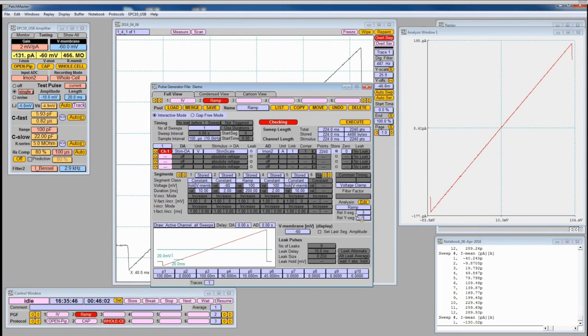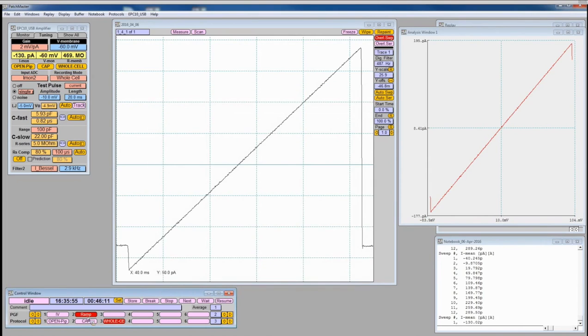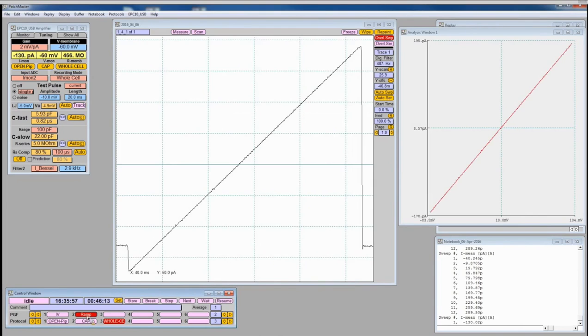It's still segment number 3 that is being analyzed. Okay, so, and this we close. And if we now run the ramp again, it looks much nicer. Okay, so here it is. The ramp has now very nice definitions at the beginning and end. Now these are little things, not really that super important, but it should give you an idea already of how complex the program can be and how you actually can use it in many different ways.